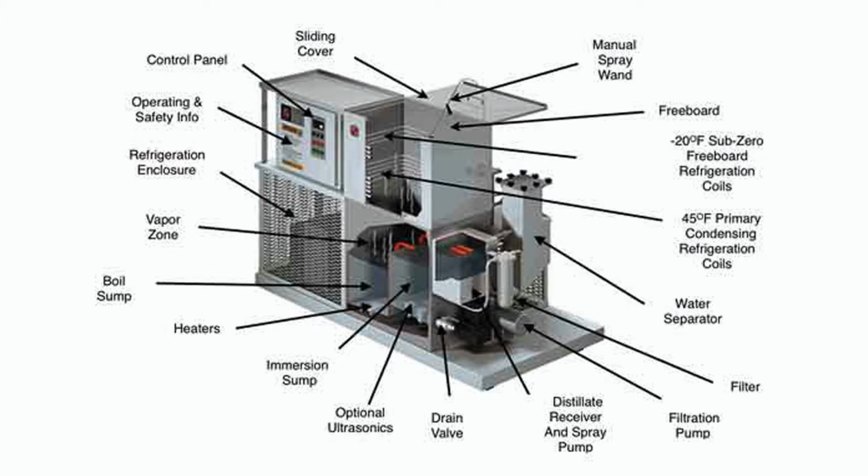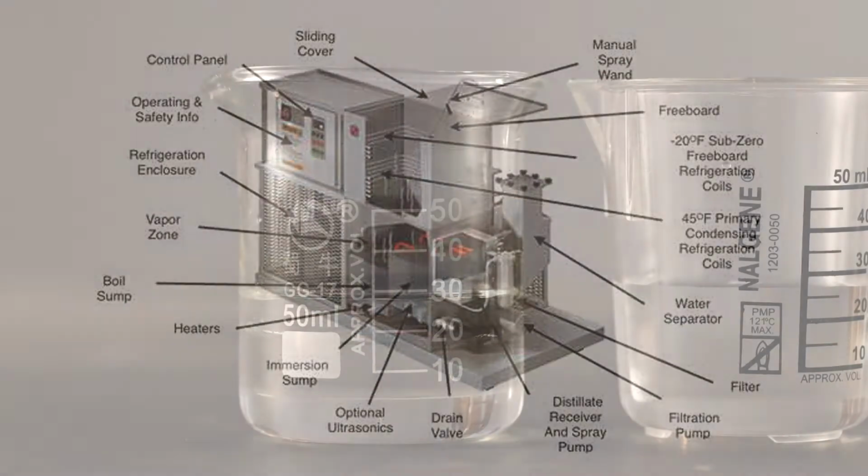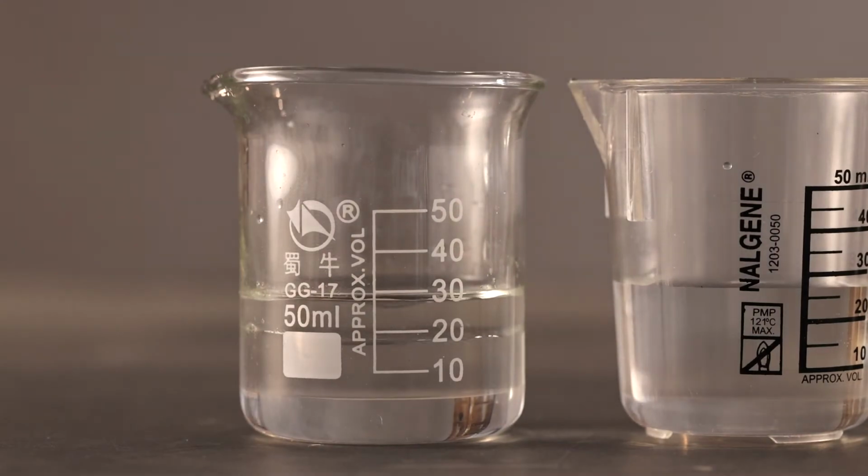The water portion on the separator should be drained off on a regular basis to avoid contamination, which could lead to the vapor degreaser going acidic or giving you extra water in the samples you use for acid acceptance. Samples for acid acceptance testing are taken from the spray wand, which uses solvent from the solvent portion of the water separator. It is recommended to drain off the water valve of the water separator each day to keep it running efficiently. Refer to your manual from the equipment manufacturer on retrieving the solvent from the correct drain on the water separator and also maintaining it.